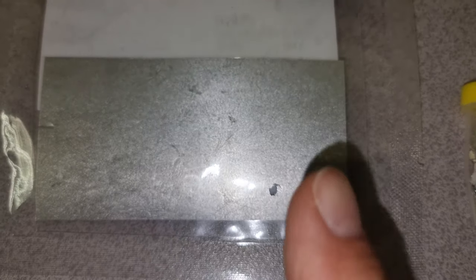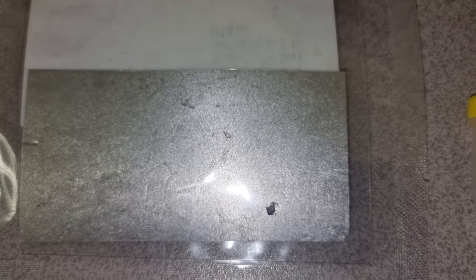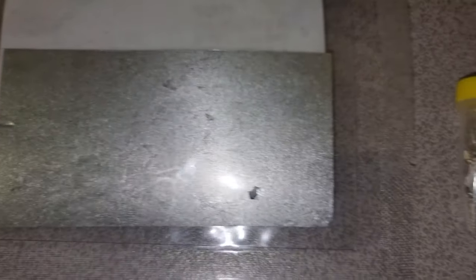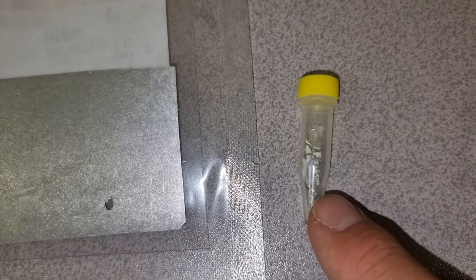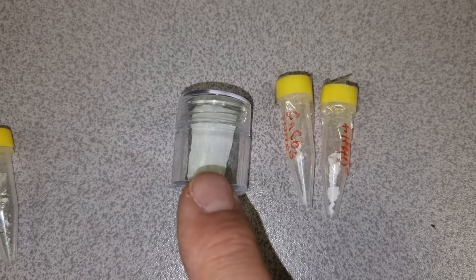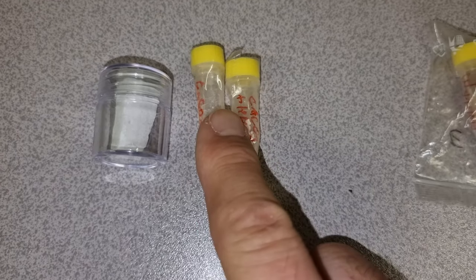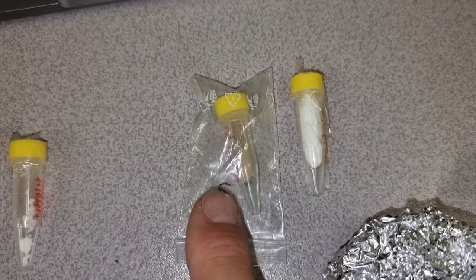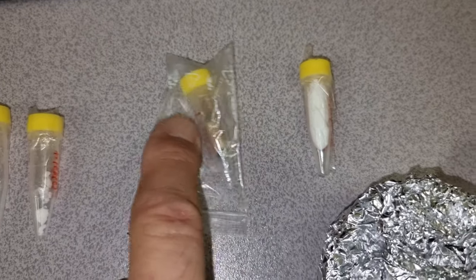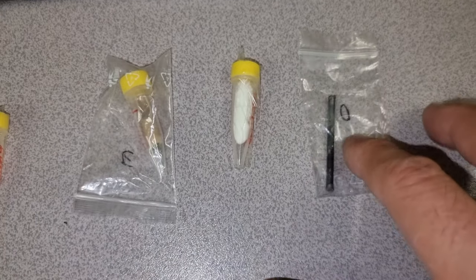We also have the raw indium here that we exposed to the HHO, plus some of the actual exposed indium plus HHO. Then we have the calcium carbonate before and two vials of the calcium carbonate afterwards. And then we have the tungsten rod which is part of the same tungsten rod that we tested with Amazagas.